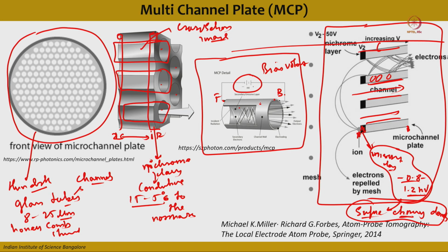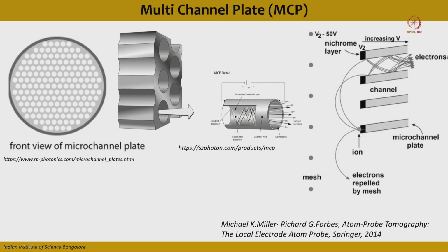Now what will happen if a positive gas ion travels from the tip surface towards the multi-channel plate?